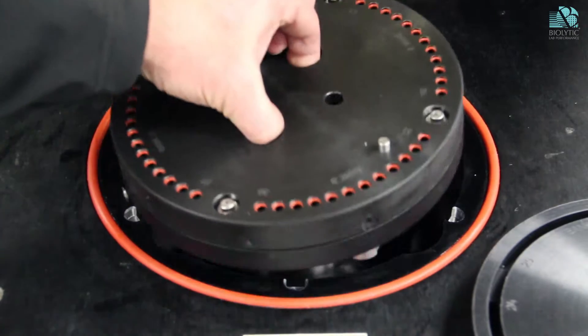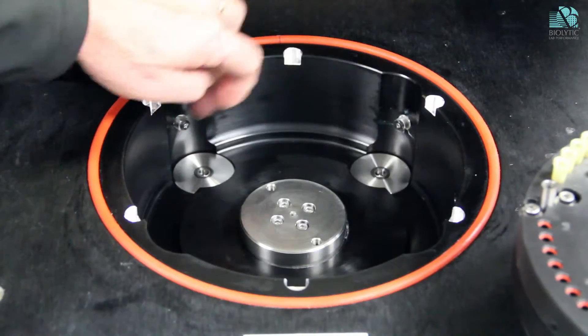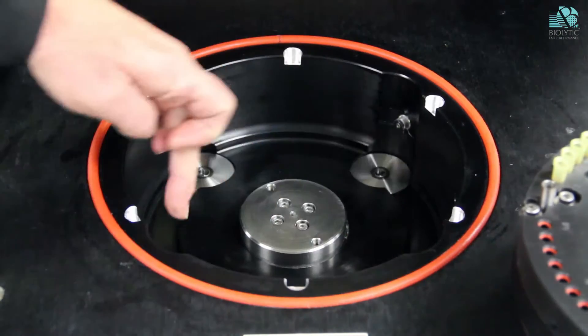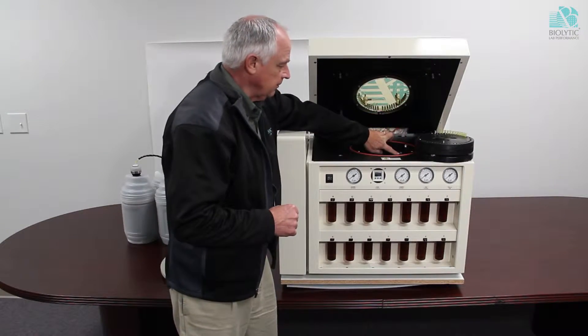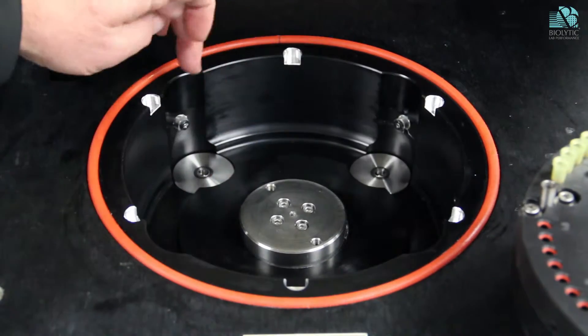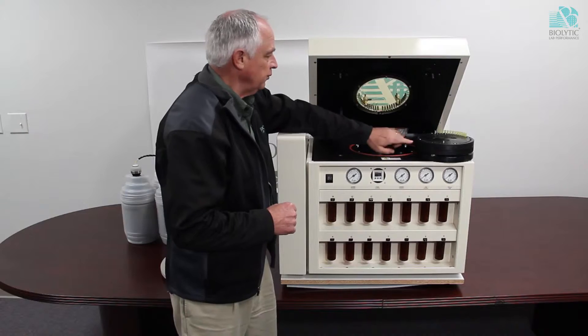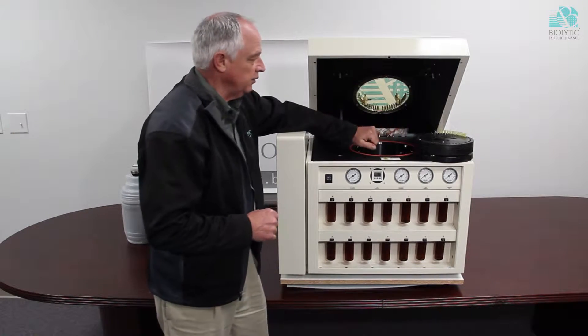Another thing that we've done is we've added in slow drains that actually drain through the sides of the rotor. You can see some shafts here on the side.